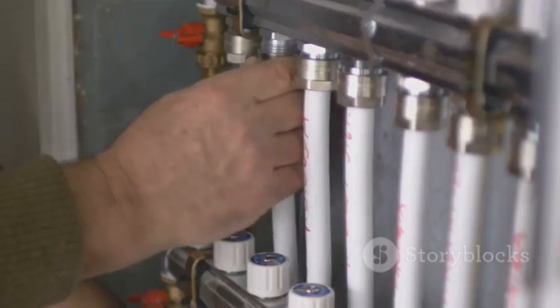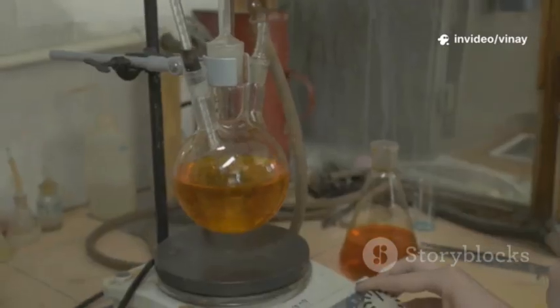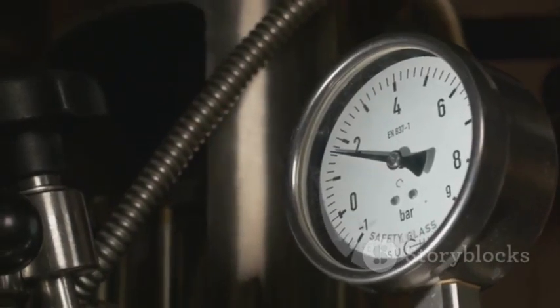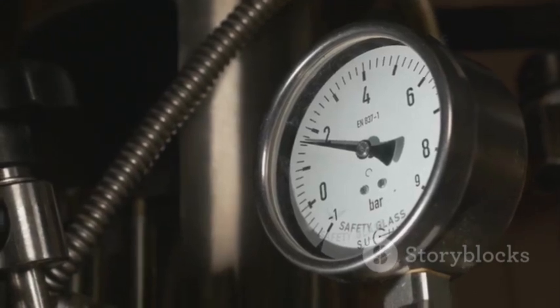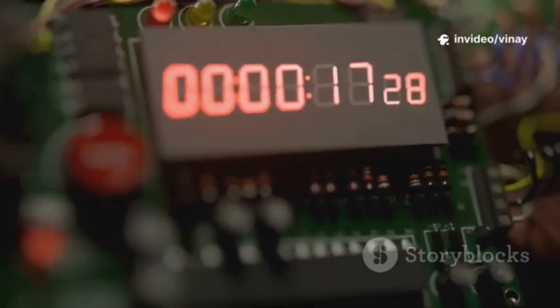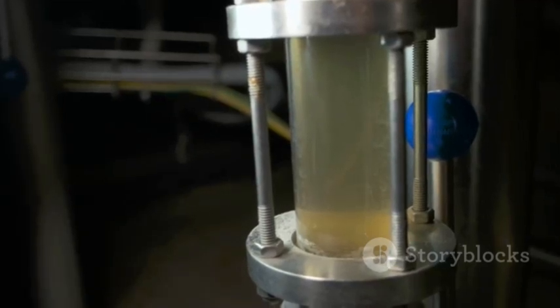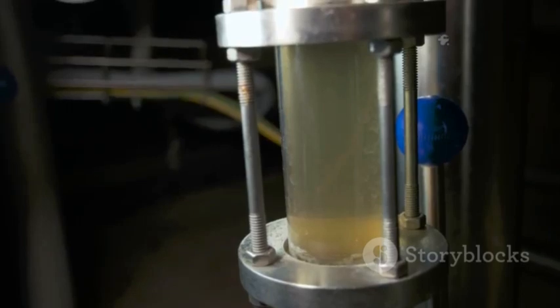Once the target pressure is reached, the gas supply is shut off, isolating the system. We then start a timer and carefully monitor the pressure in the system. Because gas is slowly diffusing through the wetted membrane, we expect to see a small gradual drop in pressure over the test period. The key measurement here is the amount of pressure that's lost over a specific amount of time, for instance, over a 15-minute period. A sound integral filter will only allow a very small and predictable amount of pressure decay due to gas diffusion.